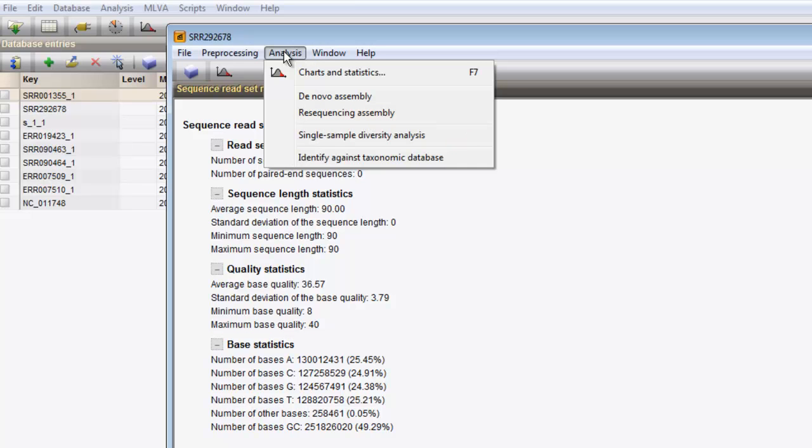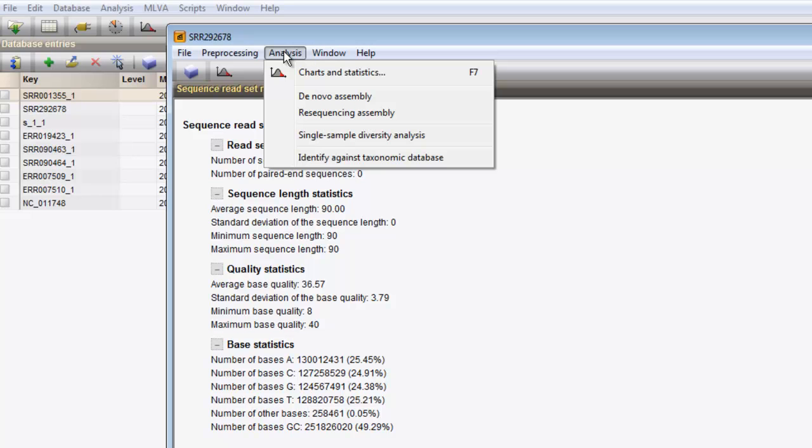The assembly analysis can either be remapping of the reads onto a reference genome or a de novo assembly. Metagenomics analysis includes a sample diversity analysis or the identification of the operational taxonomic units against a taxonomic reference database. For this analysis, we will use the de novo assembly functionality.